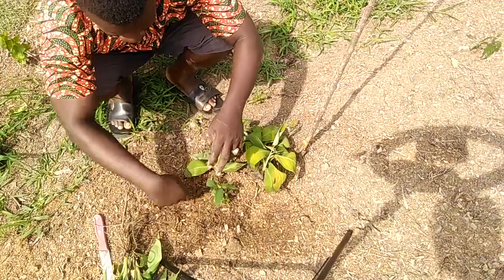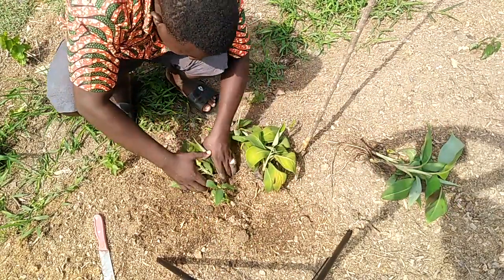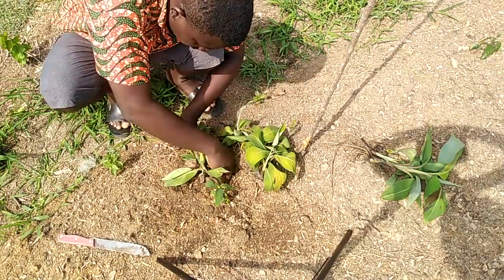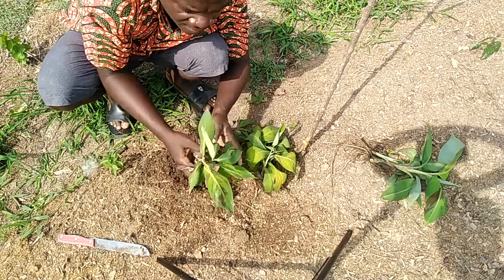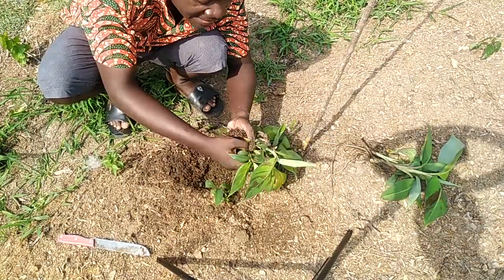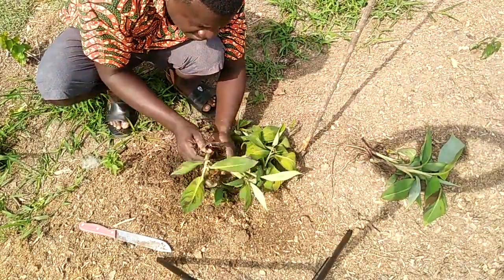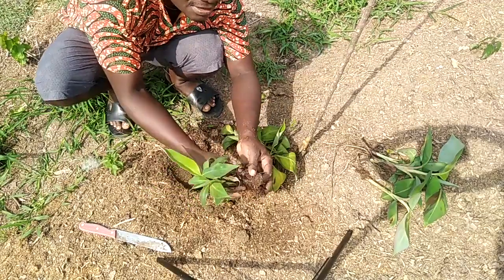So at least we have this. Let's look — one, two, three, four, five, six, seven. Very interesting. With that one you can separate the big ones and leave these ones for them to continue growing. So it's just also one, and it still gave us seven.